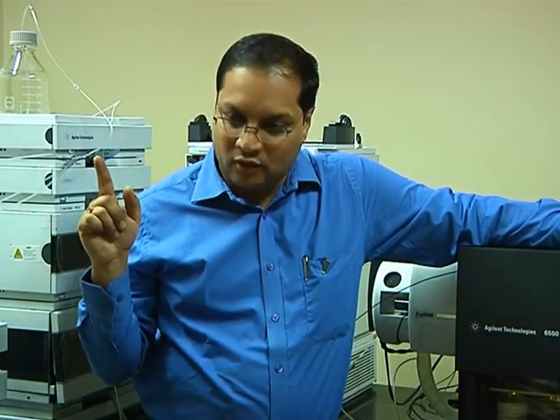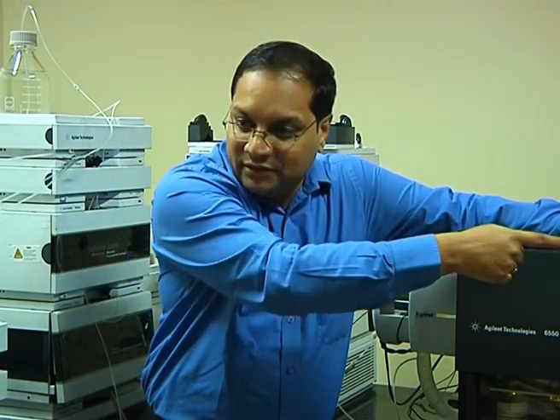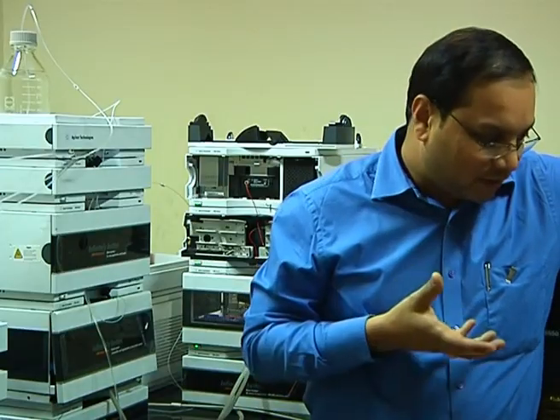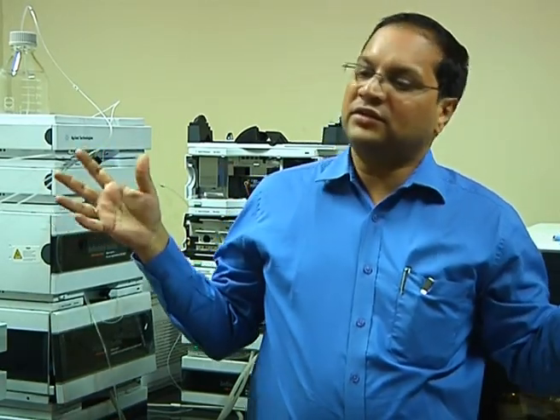quantification. Of course, it cannot be as sensitive as a triple quadrupole, for the simple reason that the third analyzer is scanning. It is not a mass filter like in a triple quadrupole. Since it is scanning, it is wasting time. It is scanning something which is not relevant, and hence you may lose something. That's why it is less sensitive. It is not as sensitive as a triple quadrupole.